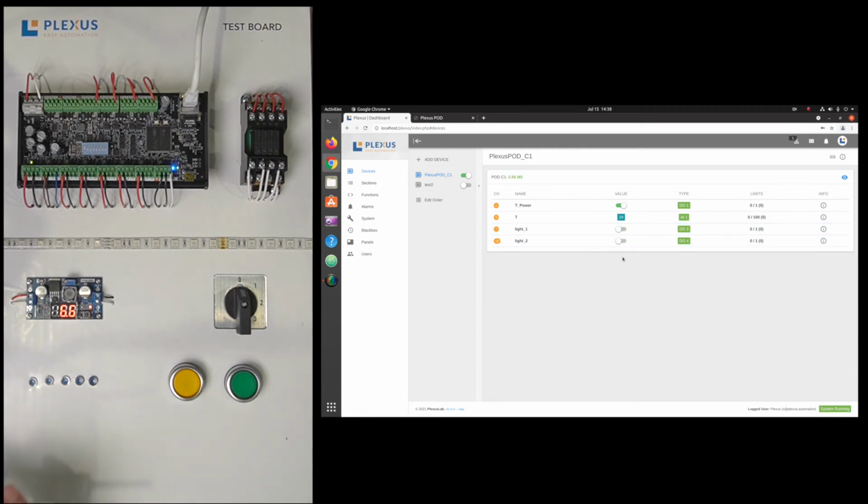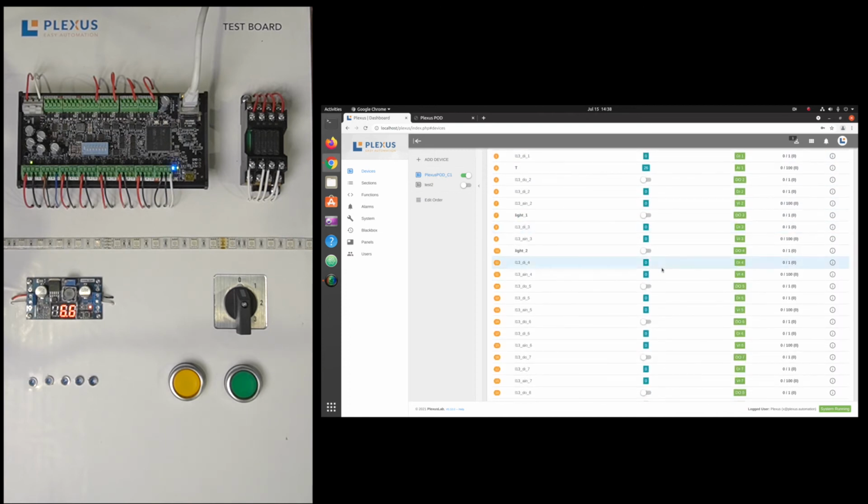Now the thermocouple is over here. You can see it's 23 degrees. If I hold it in my hand, we're going to see the temperature rising just slightly, a little bit. So you have direct feedback of your sensors and your actuators. You can just directly connect them here. Now I'm going to change all these names and show you that everything is going to work.